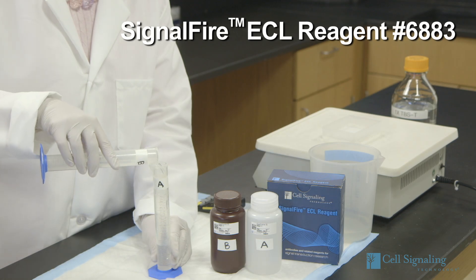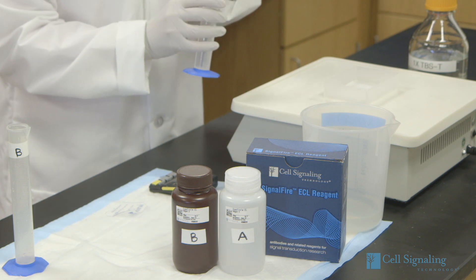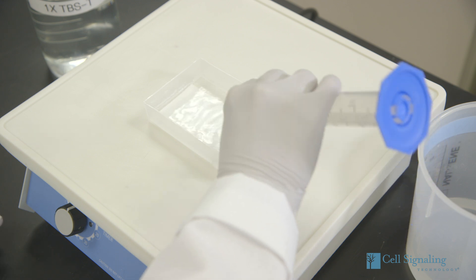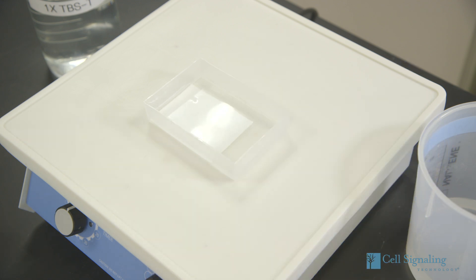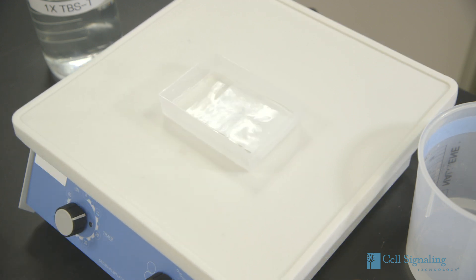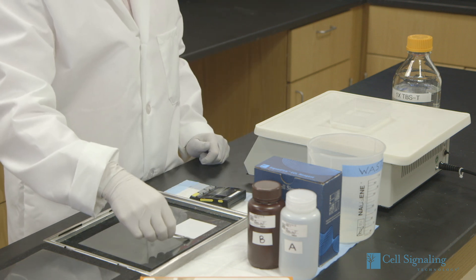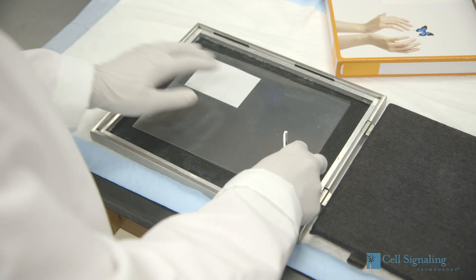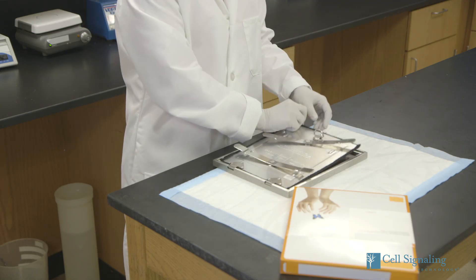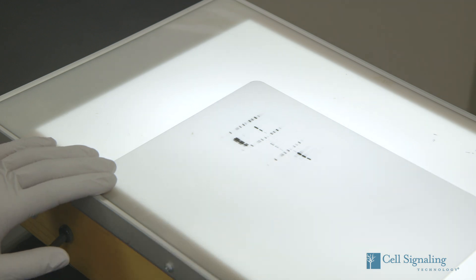For protein detection, prepare the signal-fire ECL reagent by mixing one part of 2x reagent A with one part of 2x reagent B. Incubate the membrane in 10 milliliters of signal-fire ECL reagent with gentle agitation for 1 minute at room temperature. Next, drain the membrane of excess developing solution but do not let it dry out. Then wrap the membrane in plastic wrap while it is still wet and expose it to X-ray film in a dark room. An initial 10-second exposure should indicate the proper exposure time.